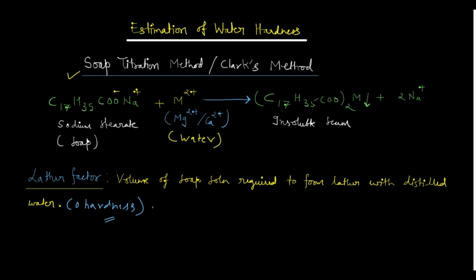When your water is distilled water, it is considered that since the water is distilled, there should be no metal ions present in the water sample, but it does not happen actually, right? So this distilled water also consumes a little of the soap solution and forms this insoluble scum before forming the lather, right? So this is the lather factor which we need to subtract from any titre value you need. This is very important, right? So I hope this is clear.